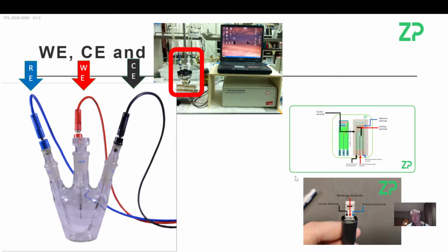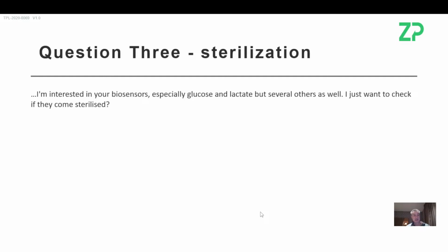So you can spend 3 years doing a PhD on a glassy carbon electrode. The form factor's all wrong, the material's wrong, the volume size in your assays is all wrong. So I do agree that people need to get onto screen printed electrodes if they're intending to go in a point of care test or rapid diagnostic test IVD direction.